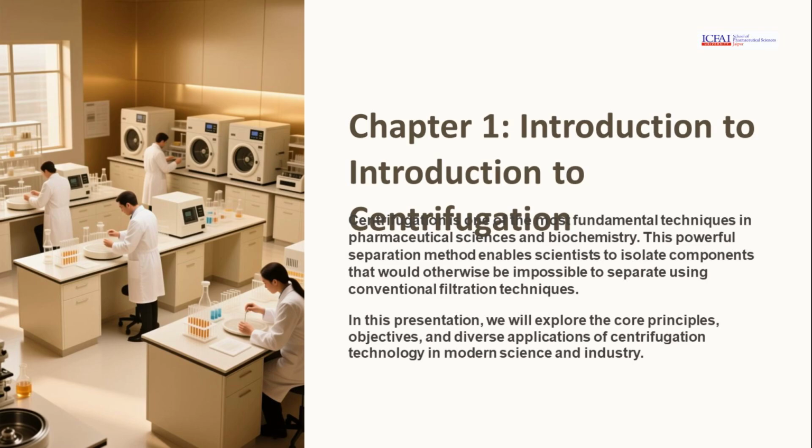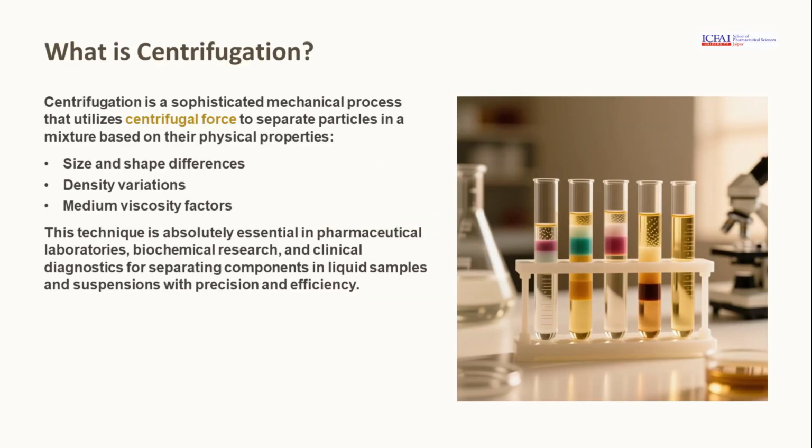industry. Centrifugation is a sophisticated mechanical process that utilizes centrifugal force to separate particles in a mixture based on their physical properties such as size, shape, density, and medium viscosity. This technique is essential in pharmaceutical laboratories, biochemical research, and clinical diagnostics for separating components in liquid samples and suspensions with precision and efficiency.